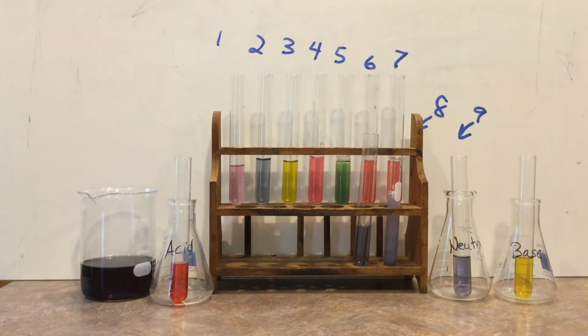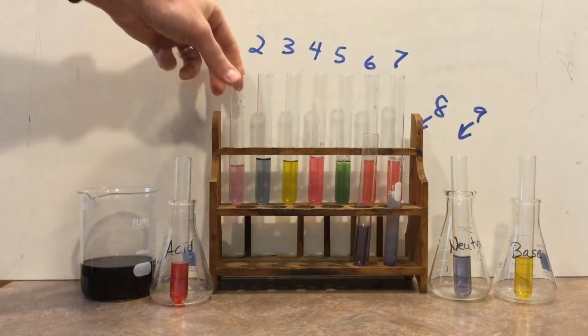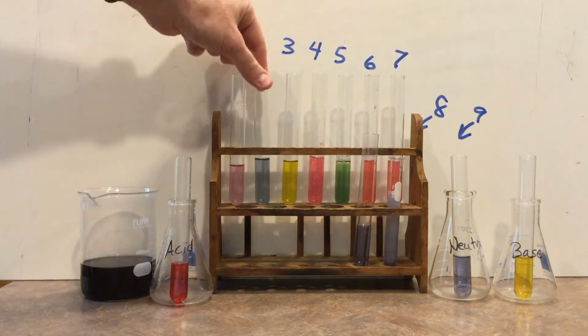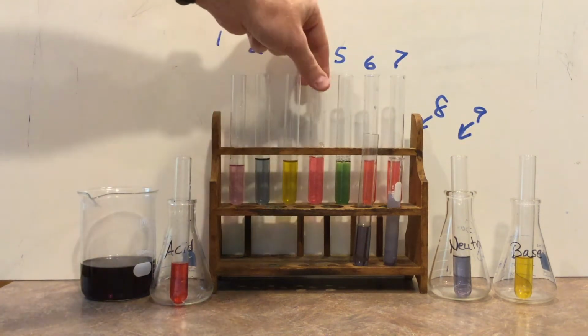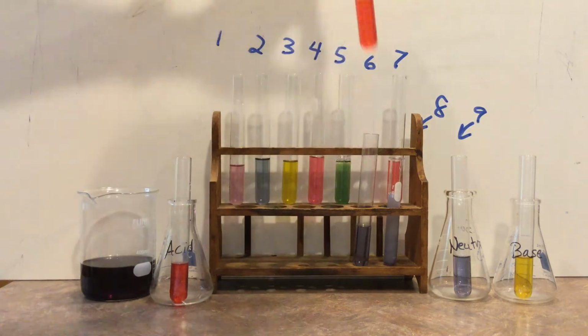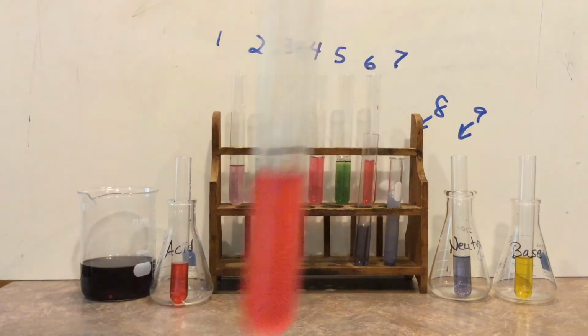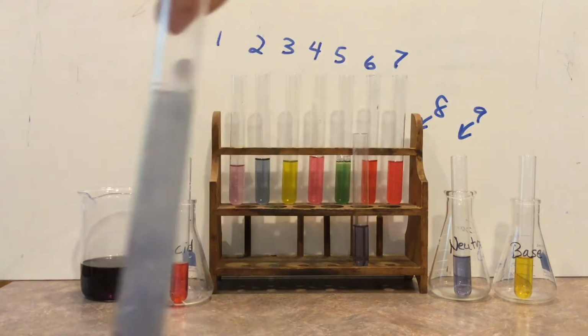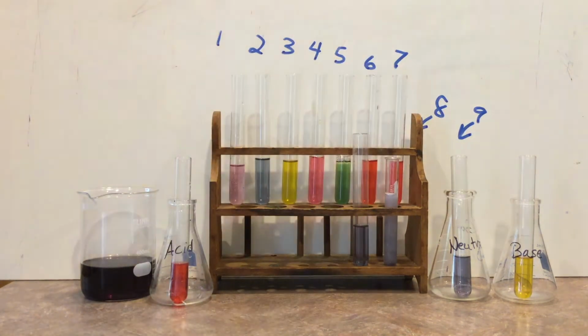Now go ahead and take the time to pause the video if you need to and make your prediction. What do you think number 1 was? Obviously you're guessing acid, neutral, or base, but which one of the substances do you think it is? Also, another helpful tip, only one of these is water or neutral with a pH of 7. So some of these didn't change much, but they changed slightly, and that's what you have to guess. And now for the actual reveal.